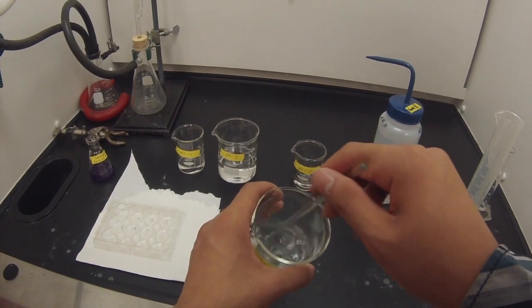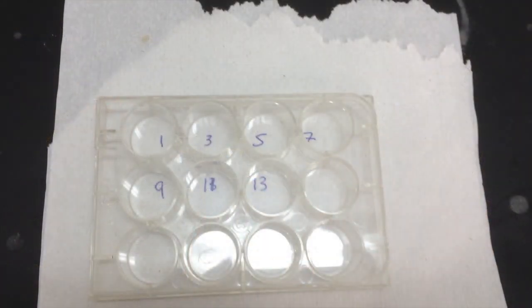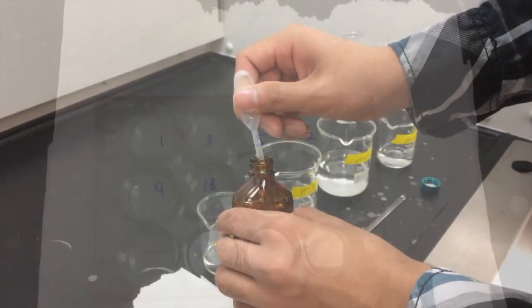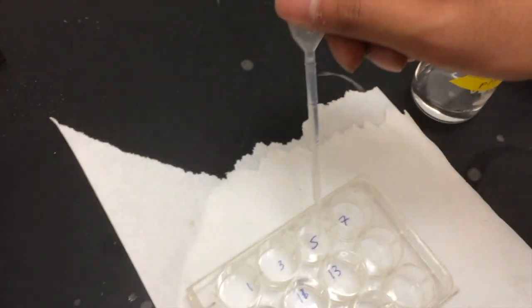On a sheet of paper, label seven wells with the appropriate pHs so that they sit over the corresponding wells. Add 2 milliliters of each solution into the corresponding well and use the stock solutions for pHs 5, 7, and 9.